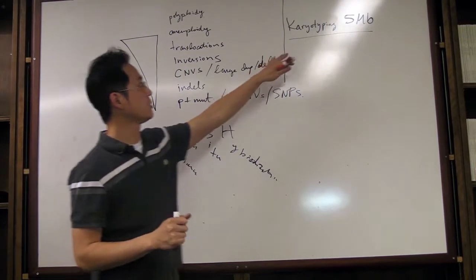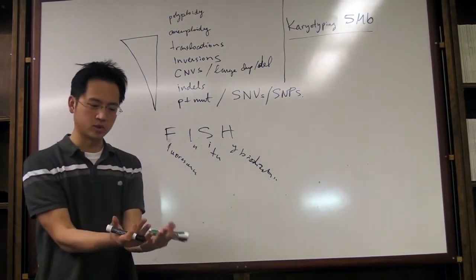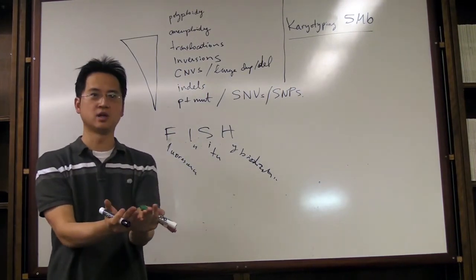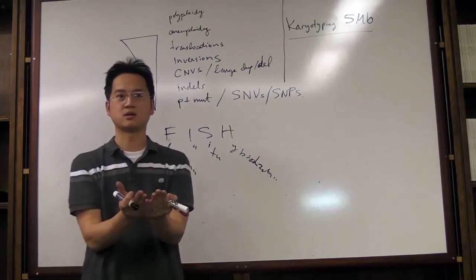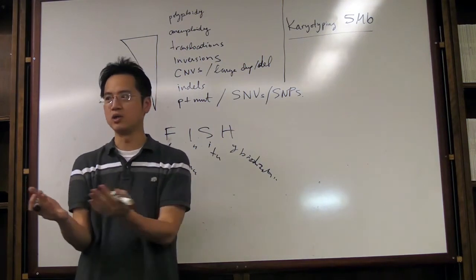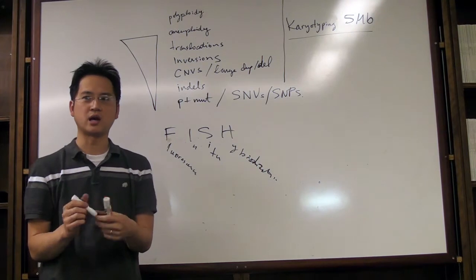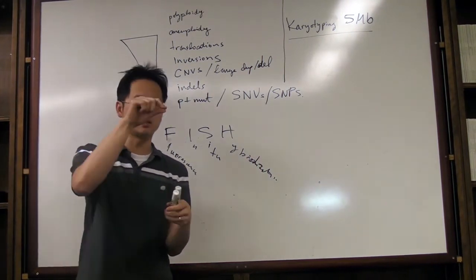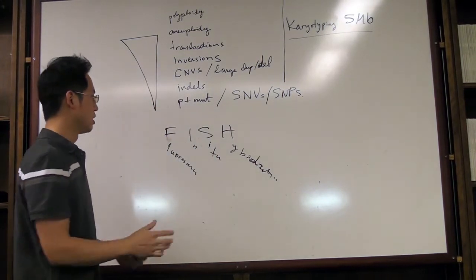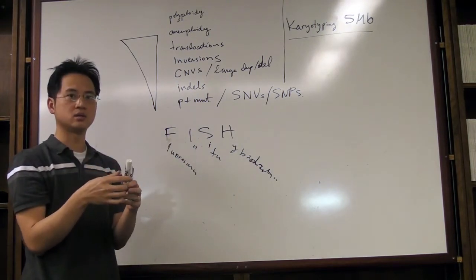Technically, karyotyping is an in situ assay, right? You are looking at the chromosomes as they are in metaphase. You are staining with Giemsa stain in situ, and you're directly looking at the DNA as it is. That's in situ. Whereas PCR, things that we do by snapshot, is far removed from in situ, right? It's sort of looking at a fluorescent signal of a PCR product that's 2 or 3 steps removed from that. So this, like karyotyping, is directly done on the tissue, the diseased tissue itself.